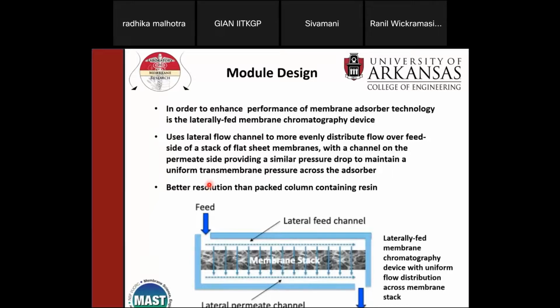Now, in order to enhance performance of membrane adsorber technology, something called laterally fed membrane chromatography device has been devised. By the way, when you get these slides, I can add the references, because there are references to this, okay? So this is somebody at McMaster University in Canada who's been working on this. So here's the problem. If you have a membrane device, we talked about the fact that you have fast convective flow, so you're going to have more efficient transport of the species you want to bind to the ligand, and therefore you have higher dynamic binding capacities that are independent of flow rate and so forth.